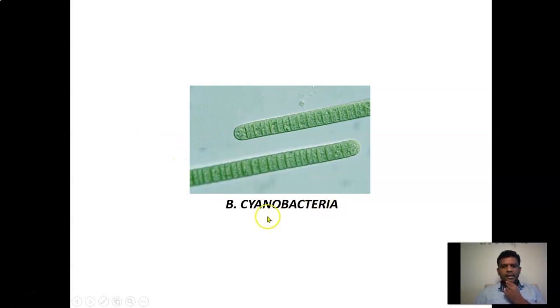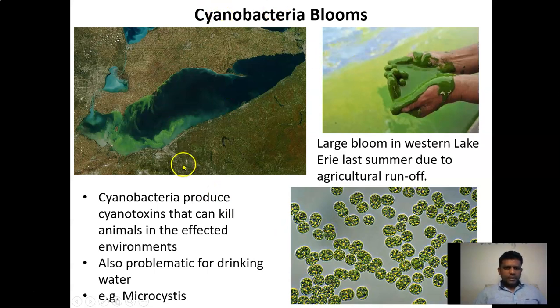In the second part of the lab, you will look at cyanobacteria. As I mentioned, cyanobacteria are a kind of bacteria, a group of bacteria. While bacteria are colorless and you need a stain to visualize them, the cyanobacteria are already colored because they tend to have pigments, like photosynthetic pigments such as chlorophyll. Cyanobacteria, you can observe them in nature, and sometimes they cause all kinds of problems.